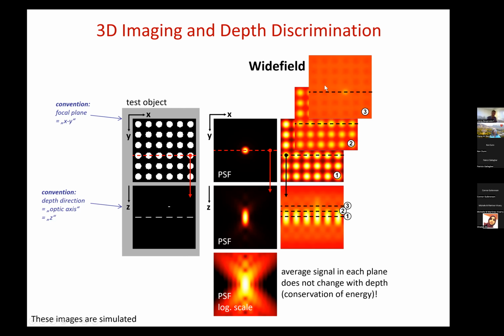It becomes this medium level intensity level. And that is exactly for that reason I described. So up here, while each of these disks is illuminated only a little bit, many of them emit light at the same time and contribute to the signal here in each pixel.